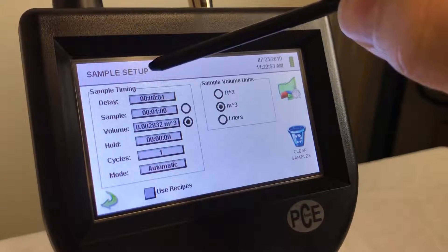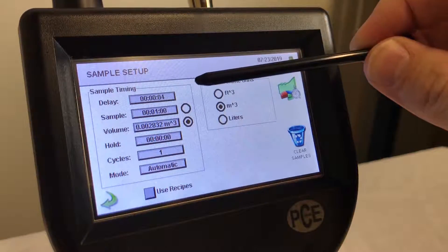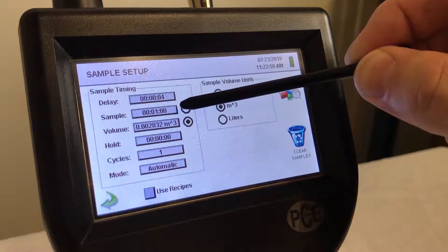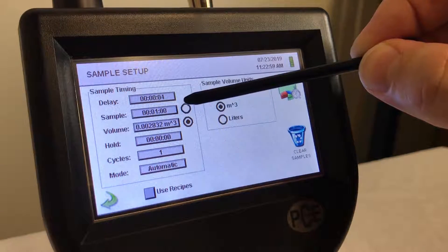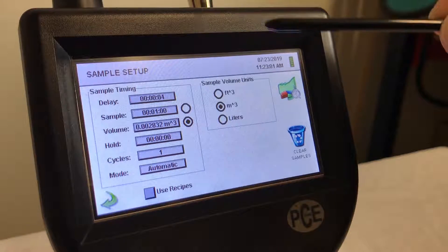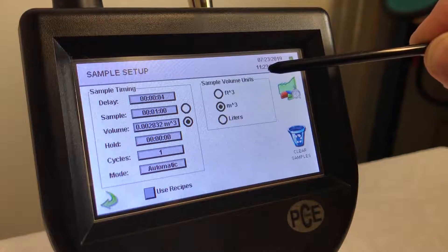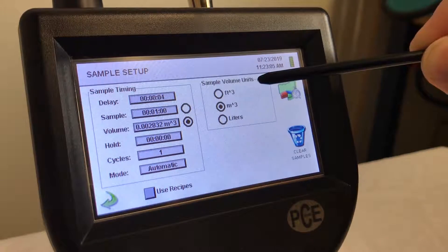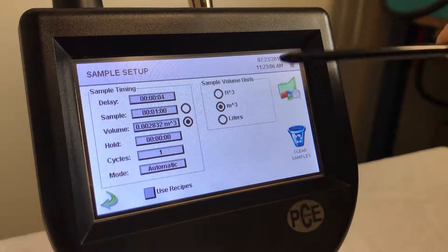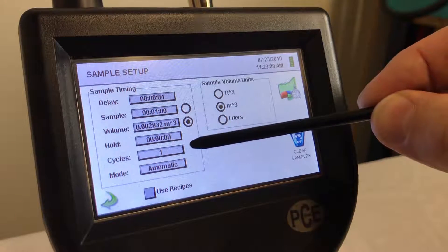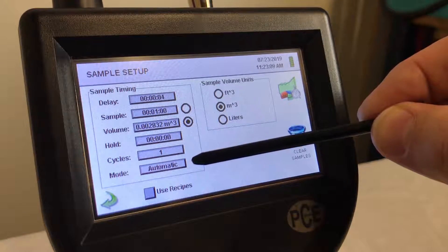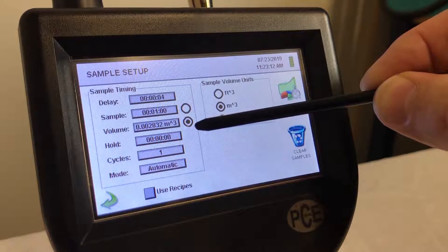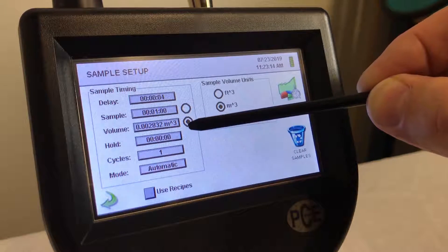You want to set up your sampling time — this is where you would set your delay. This is where you set your sample time, and you can also set up your sample volume units: either cubic feet, cubic meters, or liters. You can tell it how many cycles you want to run and your hold time in between samples.